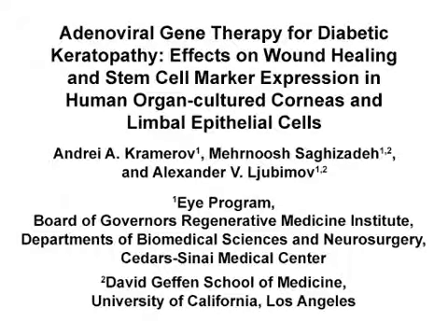The overall goal of this experimental protocol is to describe molecular alterations in human diabetic corneas and demonstrate how they can be alleviated by adenoviral gene therapy in organ-cultured corneas.